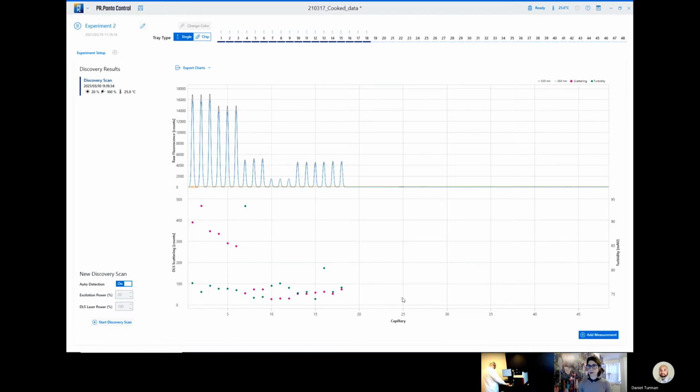So what we have here is a good look at our concentration dependence of the NIST mAb in these first samples, and then these next samples are going to be our formulation screen. This is at a high pH, pH 9.2. This is at pH 7.4. This is at pH 6, and they're different buffers: glycine, Tris, and citrate.